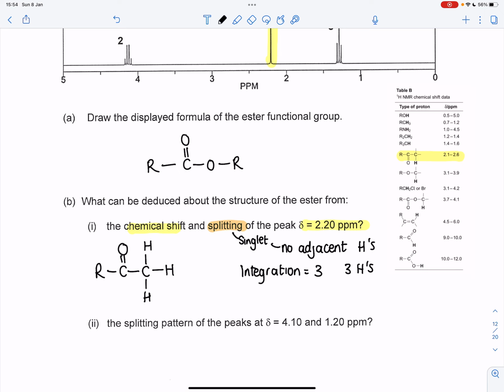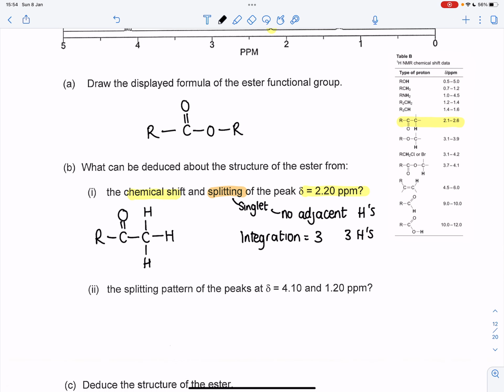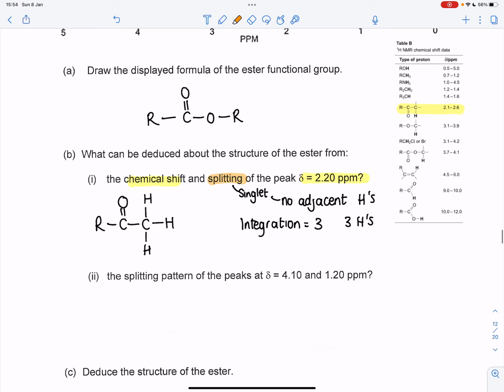We've just saturated it with hydrogens and we're at the end. So this little jigsaw piece is part of our structure. And if we were to look now at our ester, it's probably this part, because we can't have the O, it's not in our little picture. So we're looking at our structure, we can see where we've got that from. I'm just going to delete that highlighting so we don't get confused.